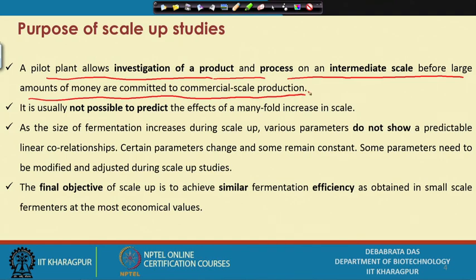So we do agree that when you run any kind of process at a small scale, the monetary involvement of the process will be very less. Am I right? Now when you go to the bigger scale, then monetary involvement will be very high. So naturally, when we go for the high investment, the investor should be confident that whatever report we get in the small scale, the same should be available in the bigger scale.